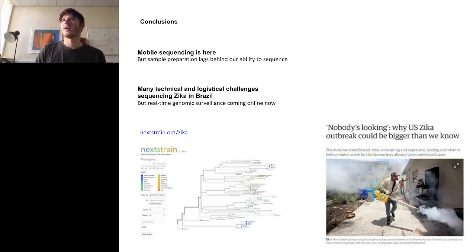If there was an outbreak of an unknown virus, we would have to use some different methods in order to try and identify what that virus was as quickly as possible. Now, you can still use DNA sequencing technology for that, but you'd have to do a different method. You can't use PCR the way that we have to amplify the virus genome if you don't know what the virus genome is to start with.